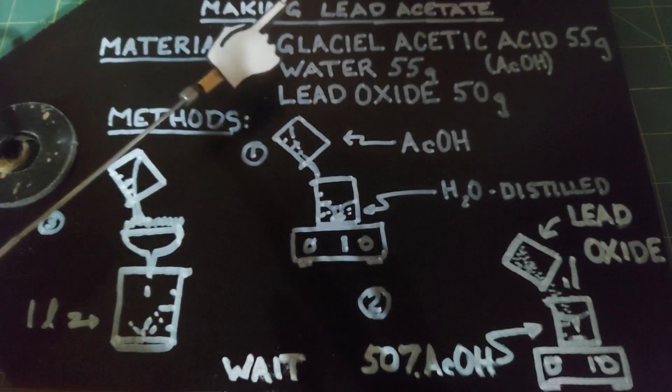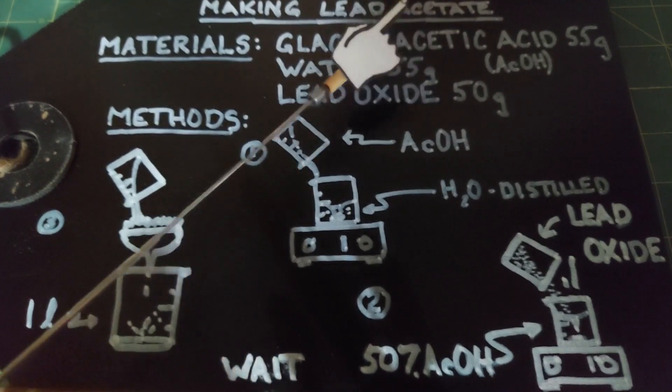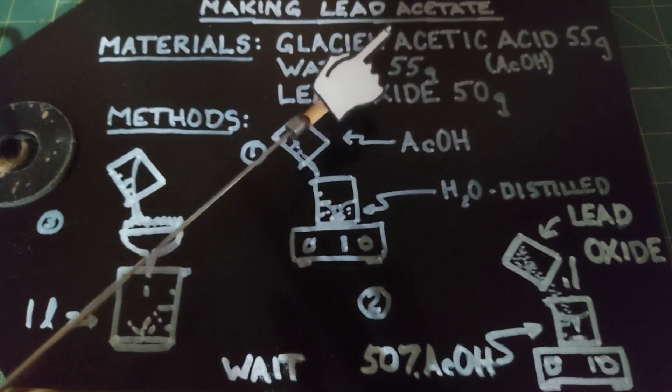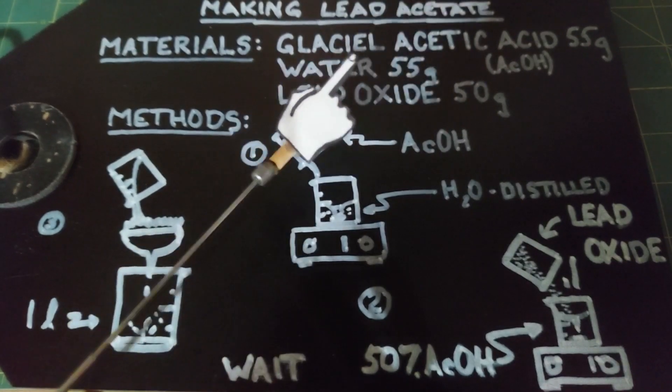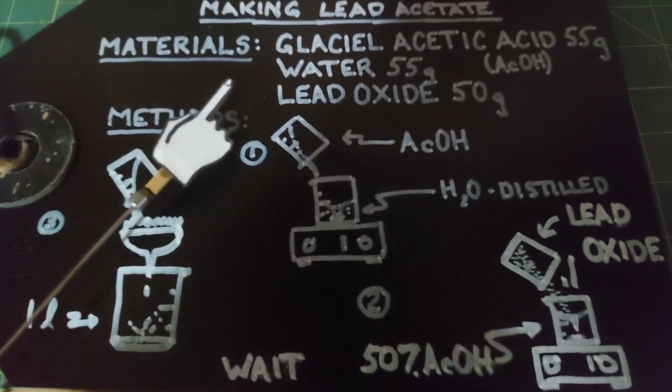In this video we are going to make some lead acetate. This all by itself was pretty neat, but I plan on using the lead acetate for another experiment later where we'll be making lead crystals.